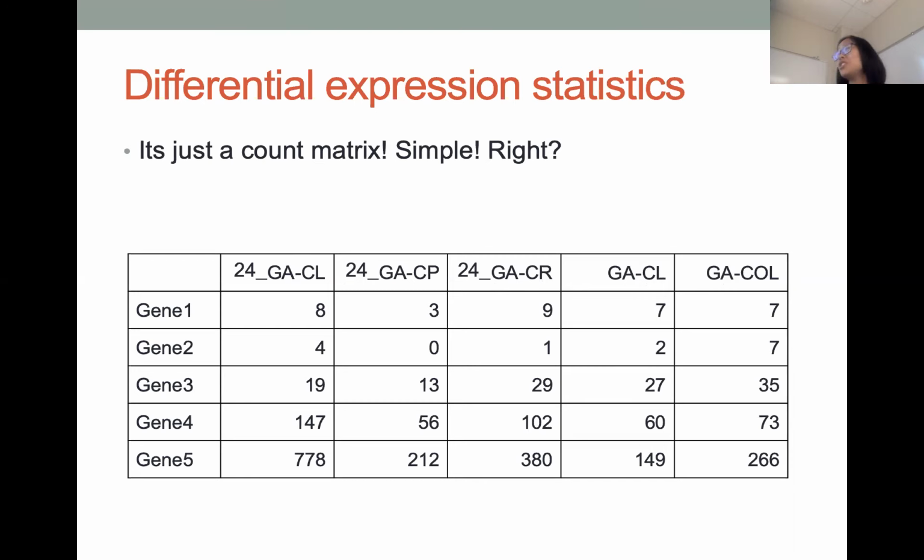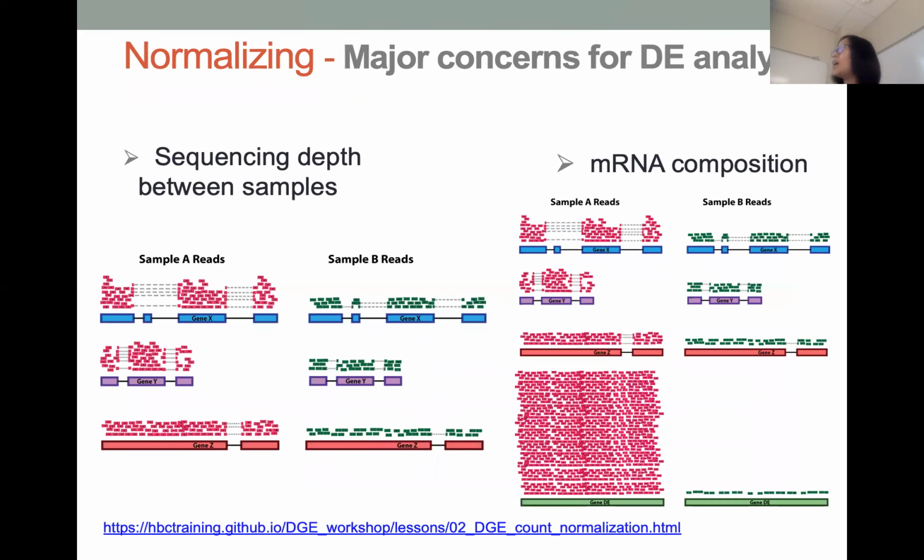We used to do that when we had only one treatment with 2 levels. But the assumption is that the variable has a normal distribution and the variance is consistent between treatments. This is a problem for most RNA-seq data, which is count data. We have a major problem in terms of the count data.